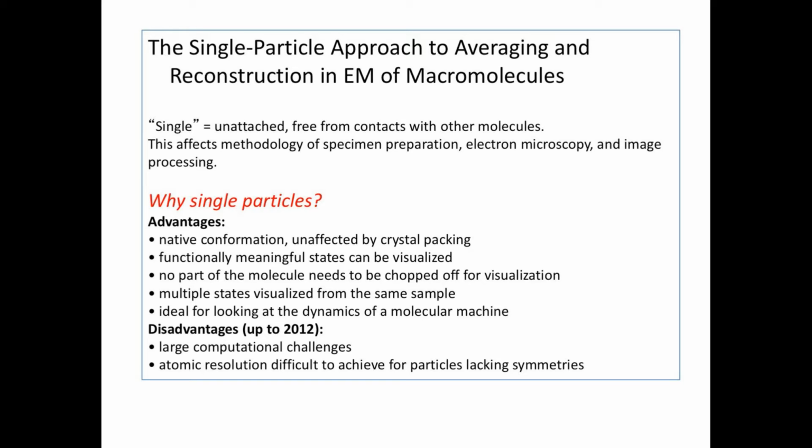Single means unattached. It doesn't mean one molecule, but rather single in the sense of the bar scene. Yeah, free from contacts with other molecules, and this affects everything in the techniques: the specimen preparation, electron microscopy, and the image processing. And again, I come back to the point: why single particles?